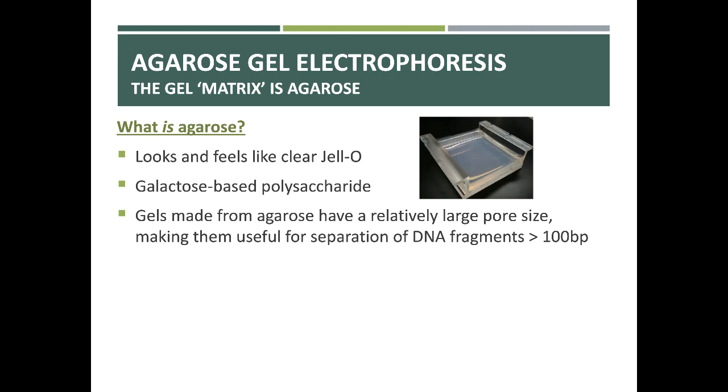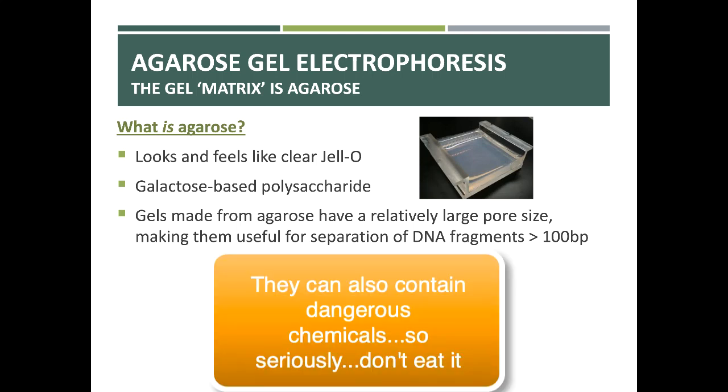Well, if you ever want to see a gel and we're back on campus, feel free to stop by and I will pour a gel for you so you can see what it looks like. In fact, if you want to, we could always just run a gel so you can see what that is all about. But when you hold it or look at it, it looks and feels a lot like Jell-O. Don't eat it because it doesn't taste like Jell-O. I'm not going to tell you how I know it doesn't taste like Jell-O, but I'm telling you it does not taste like Jell-O.